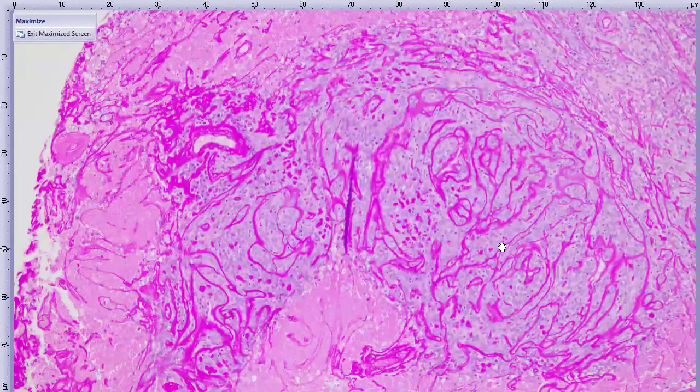Keep in mind that, apart from the ocular surface, which didn't sound like clinically there was any sort of ocular surface involvement, you want to consider that the nasopharynx and the oral cavity are both pretty close to the eye, surprisingly so. Also keep in mind that maybe more so ventral to the globe, there is third eyelid gland and potentially your salivary gland, especially zygomatic salivary gland. But based on anatomic location in this case, lacrimal gland was our favored diagnosis.